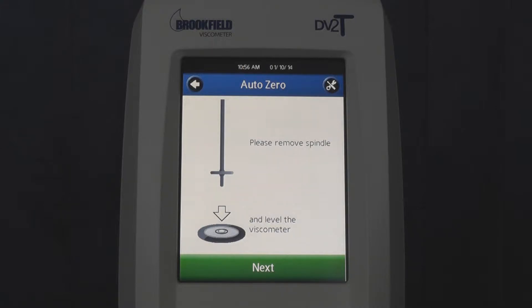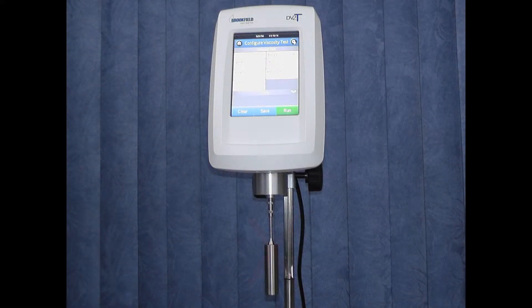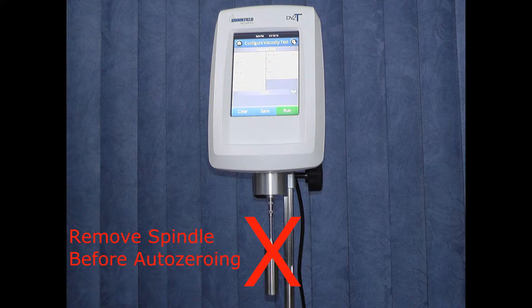You will be asked to remove the spindle and level the viscometer using the bubble level below the screen. Never AutoZero the instrument while the spindle or any other accessory is attached to the viscometer coupling nut. The spring will account for the extra frictional force and weight of the attached spindle, and it will throw off the AutoZero procedure, never allowing the instrument to find the true 0% torque mark. This will result in inaccurate readings.